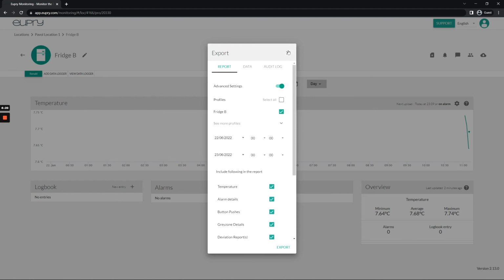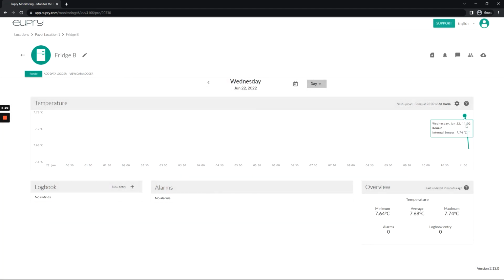So I hope that this video was useful. Even though I have only few data points here, the default measuring logging interval, as I mentioned, is 3 minutes by default. Good. Thank you very much for watching, and have a nice day.